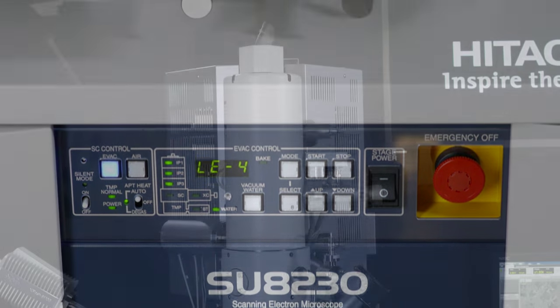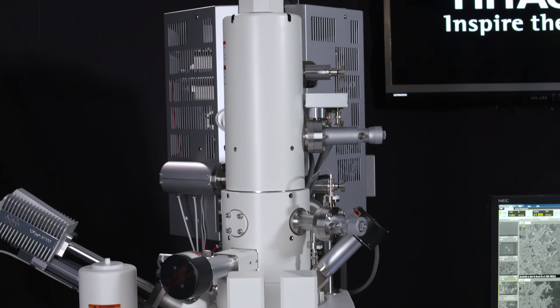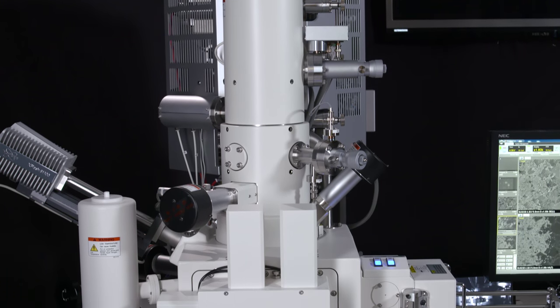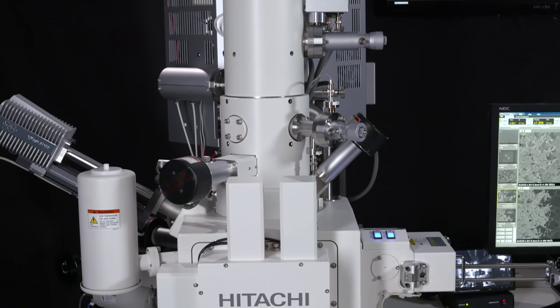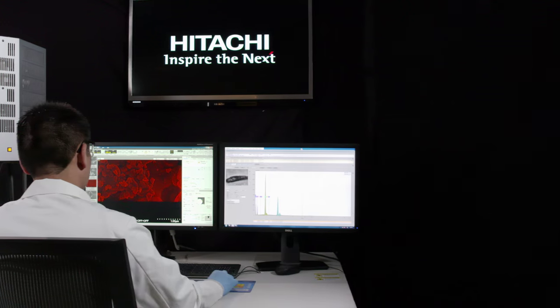With the introduction of the SU8200 series, Hitachi continues their award-winning legacy with newly developed cold field emission, or CFE, technologies.